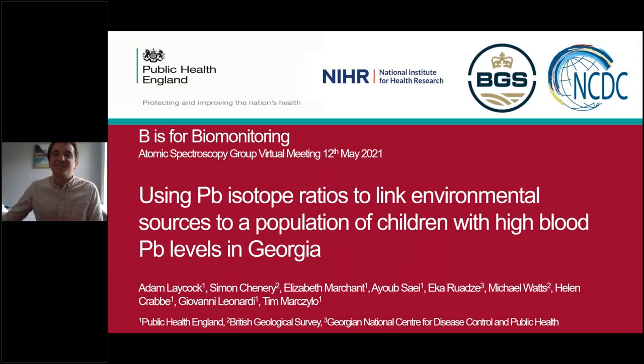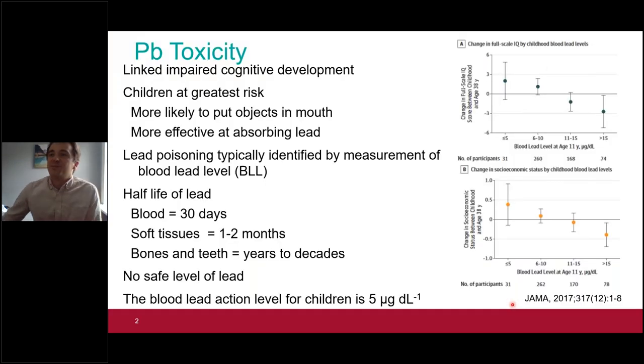Hi, Jackie. Thanks, Jackie. Right, so I think you should be able to see my screen now. Thanks for the introduction. I'm going to be presenting this work on lead isotope fingerprinting of environmental samples to link with populations of children with high blood lead levels in Georgia. This was a collaboration done with the British Geological Survey and the Georgian Centre for Disease Control. Robert already gave quite a good introduction to lead, so this fits quite nicely. Hopefully I don't repeat too much.